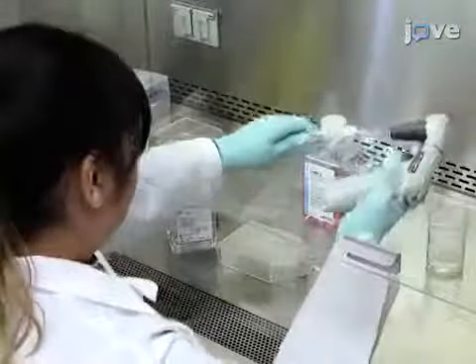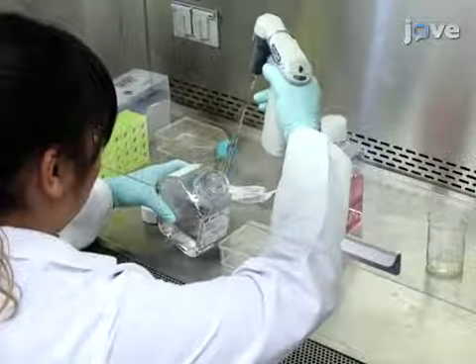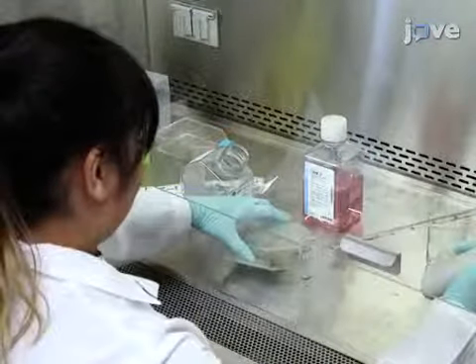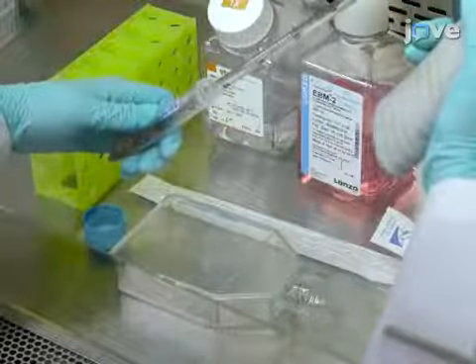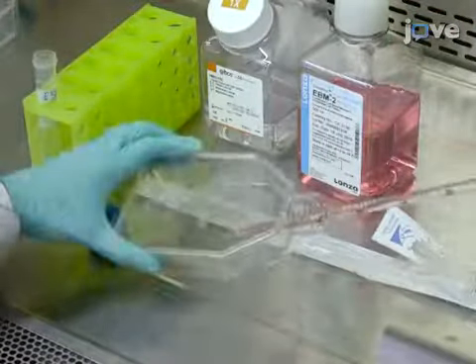Begin by passaging HCMECD3 immortal endothelial cells at a ratio of 1:5 by incubating the cell sheet with calcium and magnesium-free HBSS for 3 minutes. Then detach the cells using 5 milliliters of 0.25% trypsin EDTA for 5 minutes.